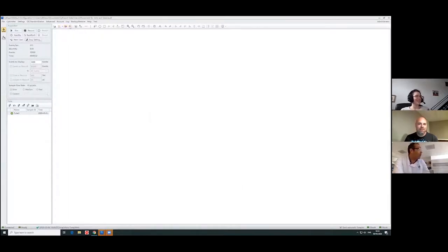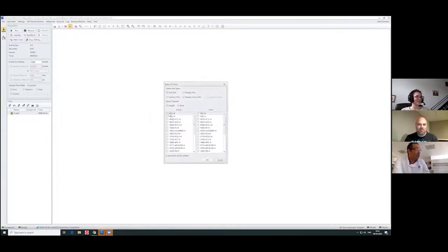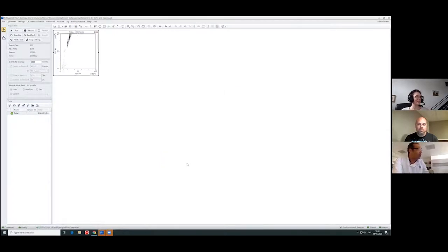So I will place one graph here. For instance, I will play with forward and side scatter, because you want to see your beads in the right spot. By default, this will be in linear. There you go. I can zoom a little bit more so you will see nicely how your beads are. You can see different aggregates. I can select this group here. Perfect and nice. It's like magic. You can zoom out.